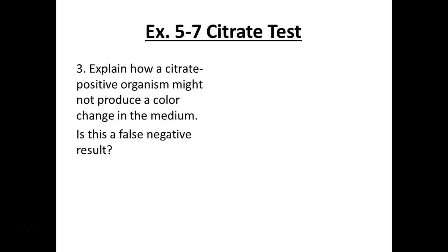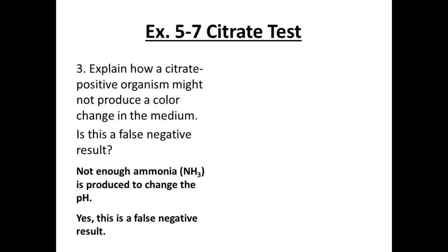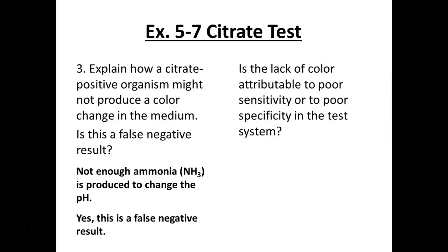Maybe you didn't have a lot of live cells. Maybe you had mostly spores, right? Improper pH, right? If the media wasn't made properly. Not a problem there, right? So is this a false negative result? Yeah, right? If it's growing, but you don't see a color change yet, right? And this would be a sensitivity or specificity issue. Sensitivity, right? Not enough of the substance to create that color change.